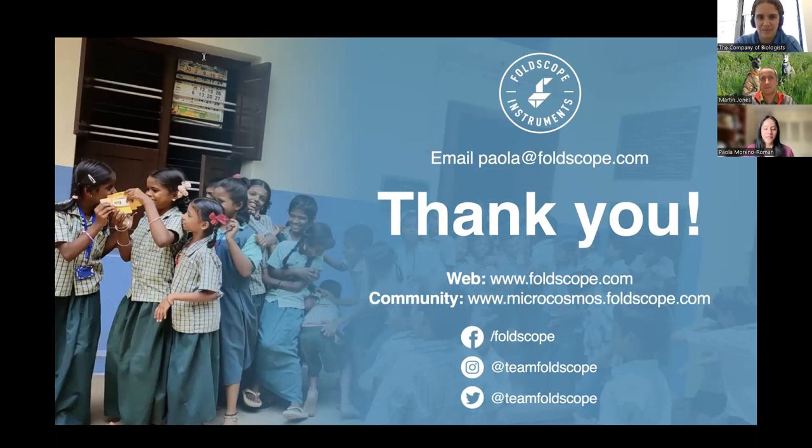And this is mainly because I have led workshops where there were a few four-year-olds. It's harder for them to stay focused on one thing. Of course, this is generalizing. And the other thing is that their fingers sometimes have trouble with fine movements, like moving around the sample and focus. So it could be a bit challenging.